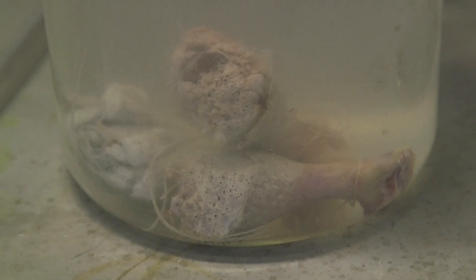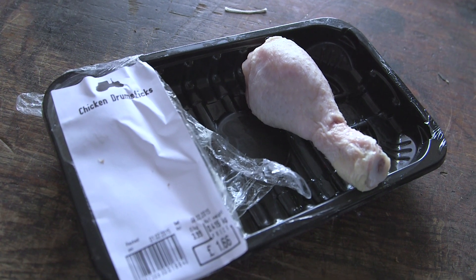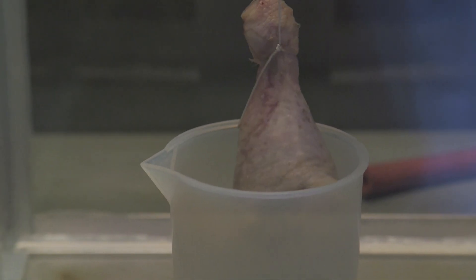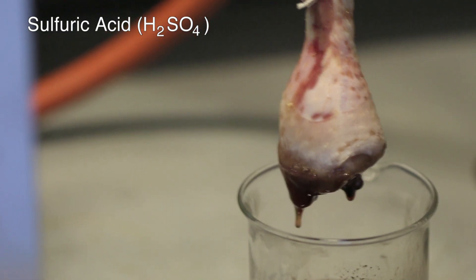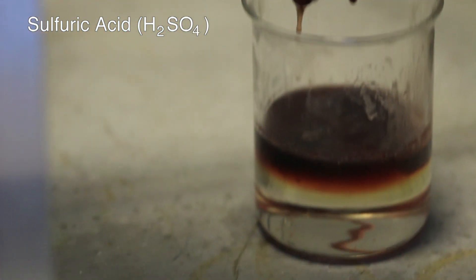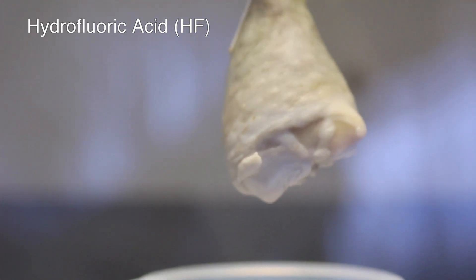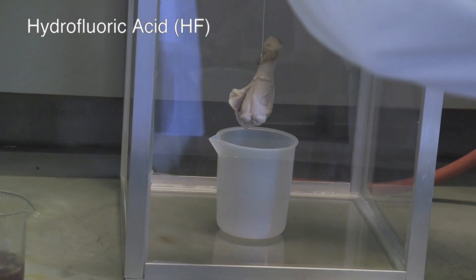It's a bit like the chicken leg has turned into a paintbrush. I think it's a really interesting experiment — far more interesting than we expected. We went home really disappointed; we'd spent all this money on the chicken legs and nothing happened. But in the end, I think we learnt a lot more about the chemistry than we'd expected. First of all, HF seems to destroy the pigments in meat very quickly. And what is quite interesting is that the structure of meat, when you remove the pigments, is absolutely white — almost like cotton wool.